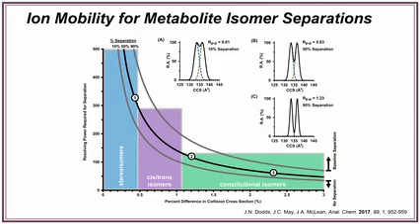There are platforms like the cyclic ion mobility, the SLIM device, the TIMS can also achieve pretty high resolution, and the 6560 drift tube now, with a post-processing method, can give you pretty nice resolving powers. Not 500, but maybe more on the order of 200.